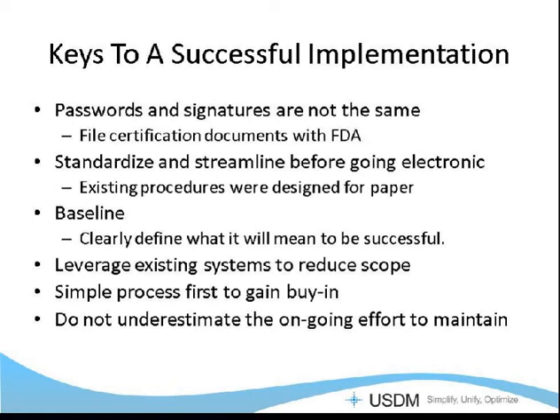So we made sure that the electronic notebook would clearly require all the different pieces of data that were necessary for the notebook to be okay. Again, like I touched on before, you definitely want to leverage your existing systems. People are already familiar with them. There's probably some functionality available in them.